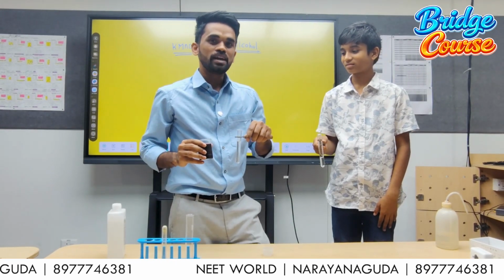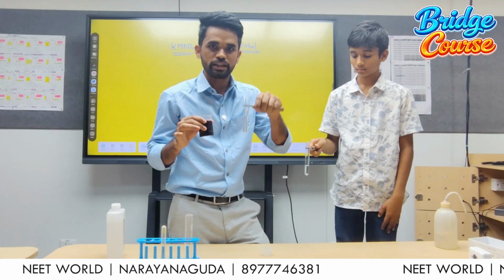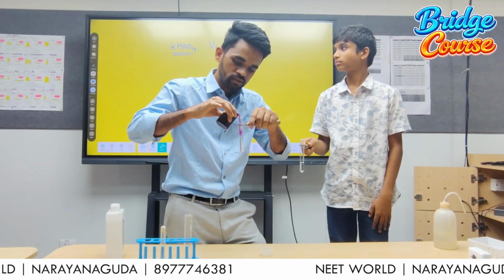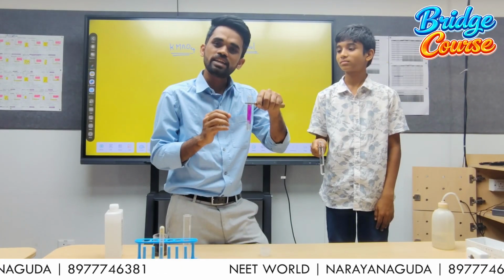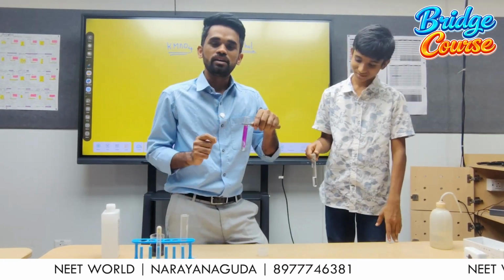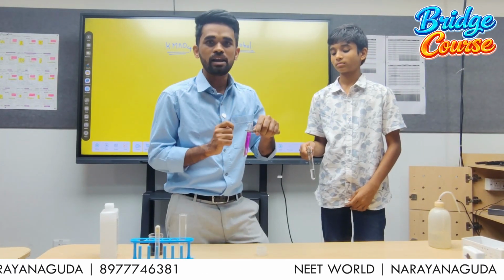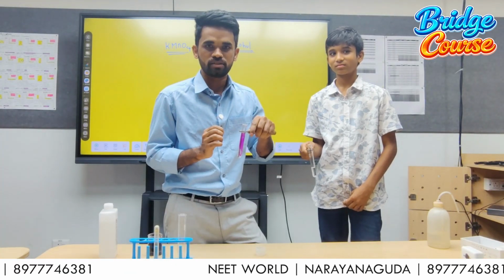So see here, let's add KMnO₄ to the water which I have taken in the test tube here. See, there is no change in the color. It appears like pale pink only, right? Now let us add the same quantity of KMnO₄ to this alcohol and let us observe what will be the change.